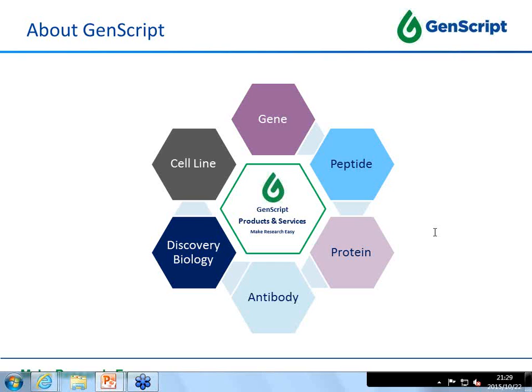I see. Okay. And could you give us an idea of how many CHO-GS cell lines you have produced so far? Okay, so the CHO-GS cell line was launched, as I mentioned before, in April of this year. From then on, we developed around 15 cell lines.